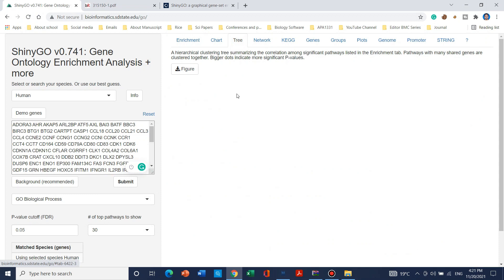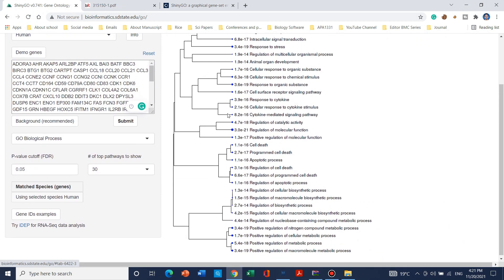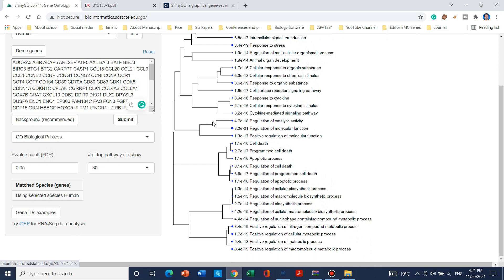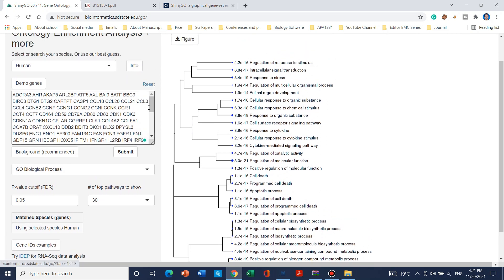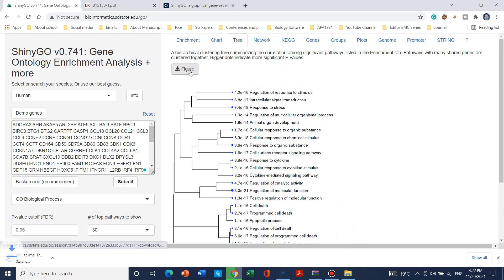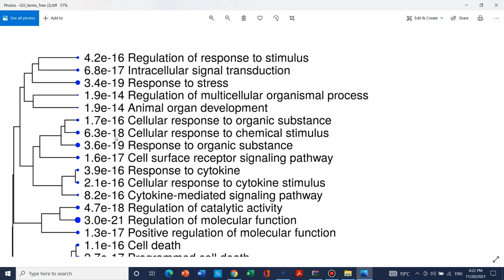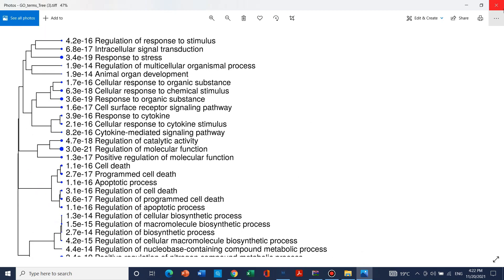Moving to the Tree section, the tool can also build a tree. This tree is a representation of the dataset of 157 genes organized into different groups. You can also download it in figure form by simply clicking the download button, and a high quality resolution figure will be downloaded for publication or data analysis.